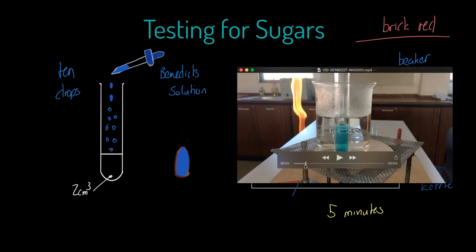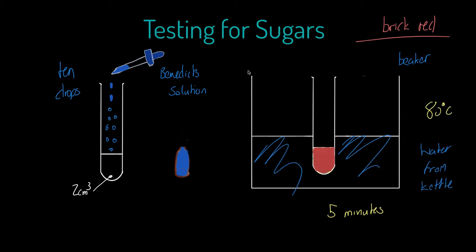Let's have a little look at this. Let's just go through this in stages. We introduce about five minutes worth, so the initial blue of the Benedict's starts to turn a kind of green color. Watch carefully. There's obviously quite a bit of sugar here, so it develops into a yellow color, that medium level sugar. Then it's turning to an orangey red. It's not quite our brick red, so we're not going to say this has tonnes of sugar, but it's pretty close, getting something between orange and redness.